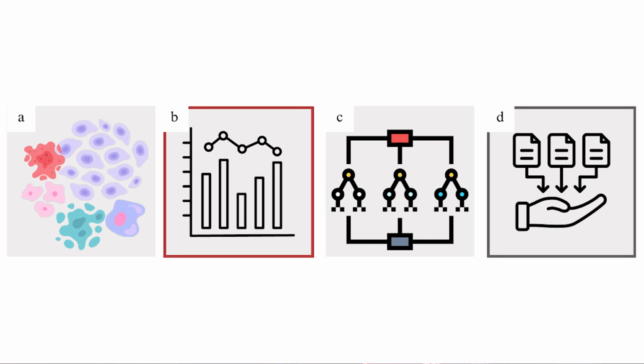In the first image A, you see that there are some cells, but it can be anything. It can be some structures of a material or so. And classification basically tells you which is what.